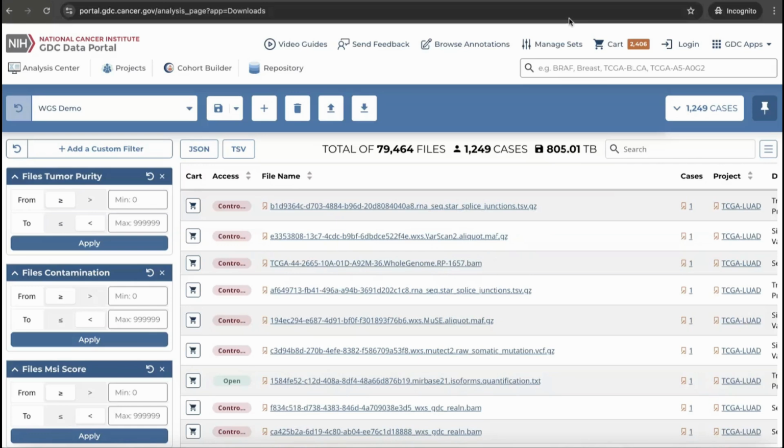But we have not planned to use Genome in a Bottle data or a curated sample from the 1000 Genomes Project to do such comparisons.